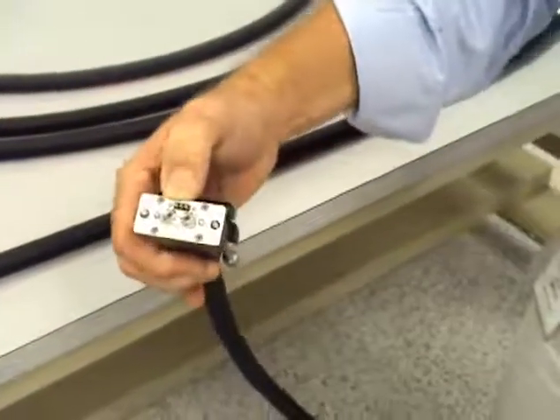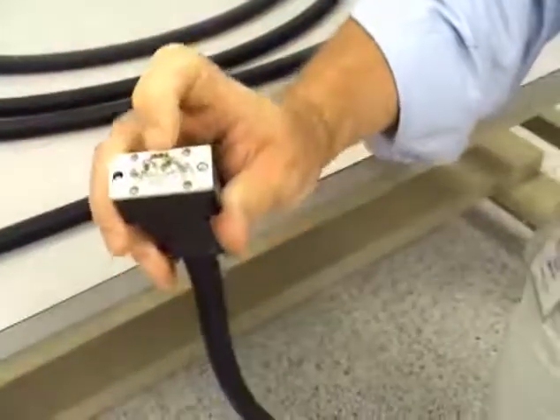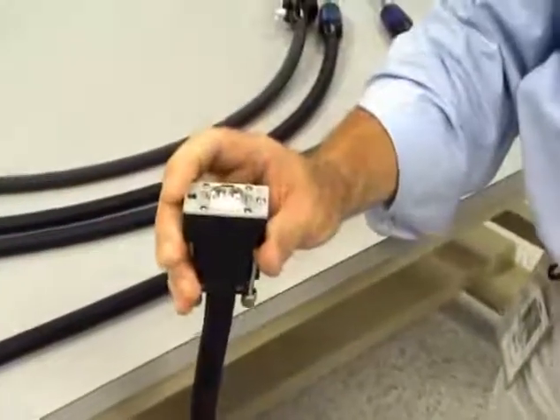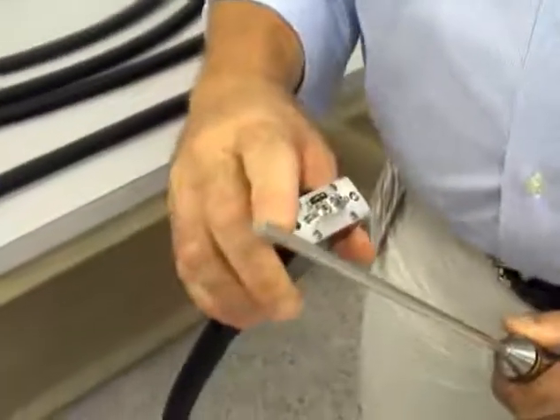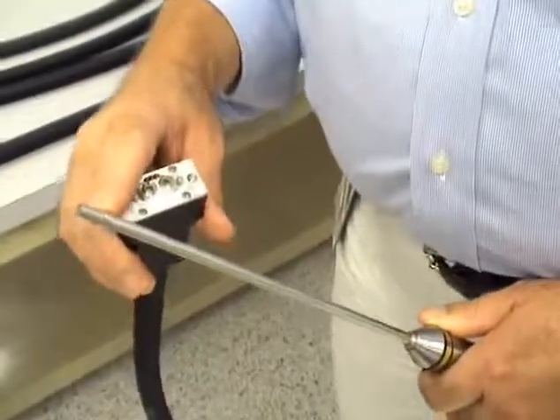You'll notice as well there are three little push pins here. These are connections for an RTD thermocouple, essentially in the tip of the probe, that allows us to capture the temperature of the reaction mixture every time we collect a spectrum.